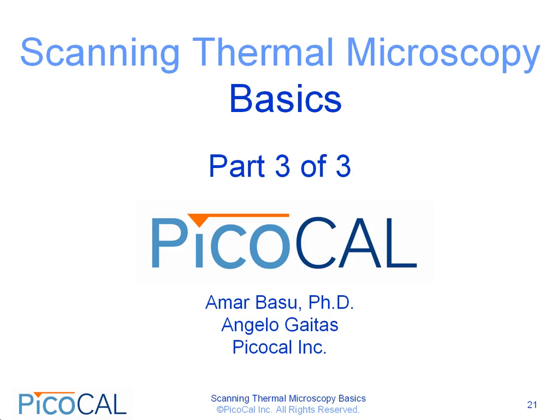Welcome to the third and final part of Scanning Thermal Microscopy Basics. In this part of the presentation, you will learn about lock-in techniques, other ways to improve resolution, different variations and various applications of scanning thermal microscopy, and will conclude with a brief history.